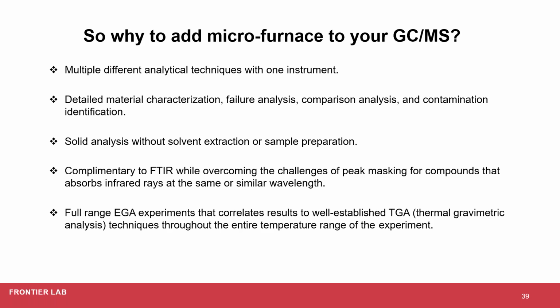And then once you perform the second shot, which means you have now thermally extracted those additives and lighter compounds, the cup again goes back for the second analysis, and that will be the leftover compounds in your sample. When you do 500 or 600 to break down those heavier polymeric fragments into smaller, more stable molecules, as I mentioned, pyrolysis, then using the F-Search you'll be able to identify the actual polymers in your sample.